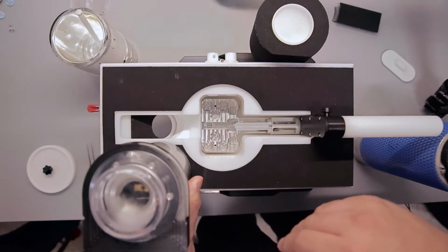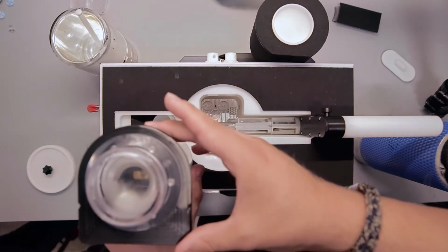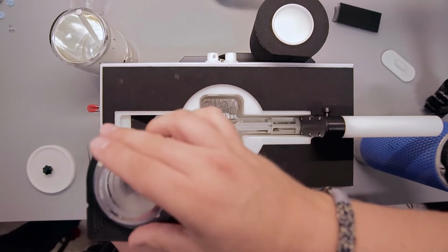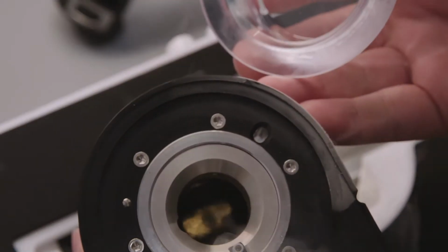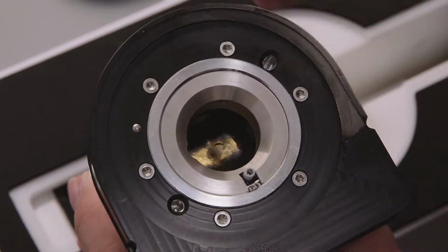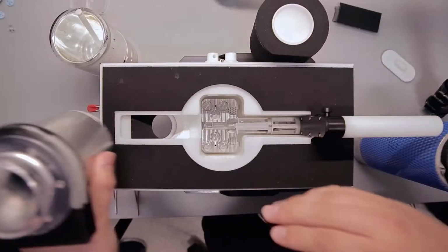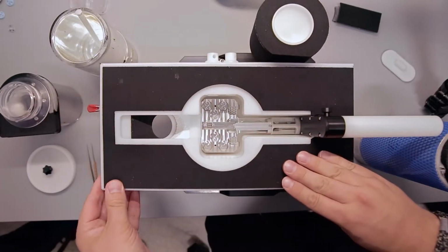Now that we're loading cartridges into a cassette, we start with a situation where we have a capsule coming from the microscope with a cassette already in it. You can see the capsule is cold, there's liquid nitrogen in, and there is a cassette in. So we put this to the side and we need to cool down the loading station.